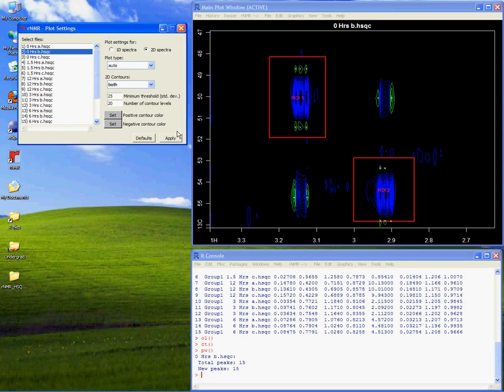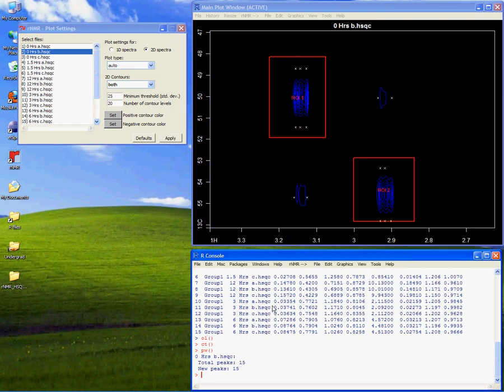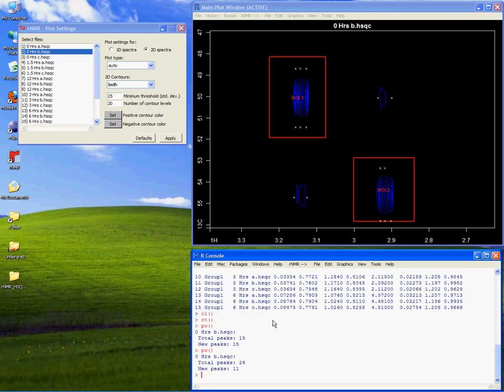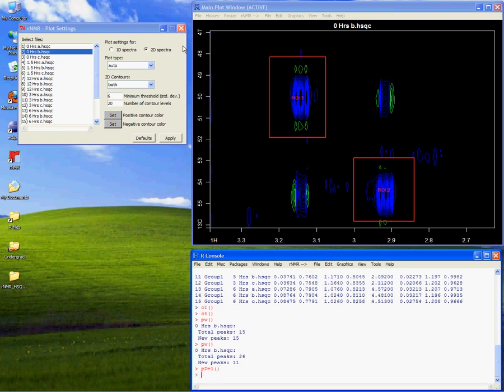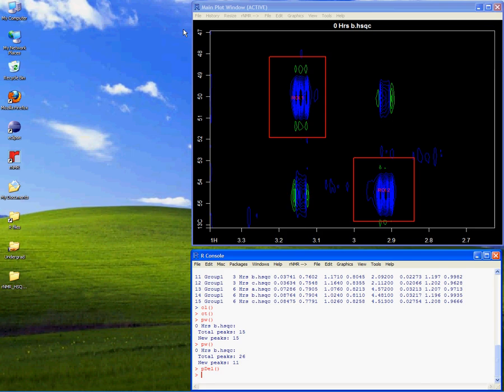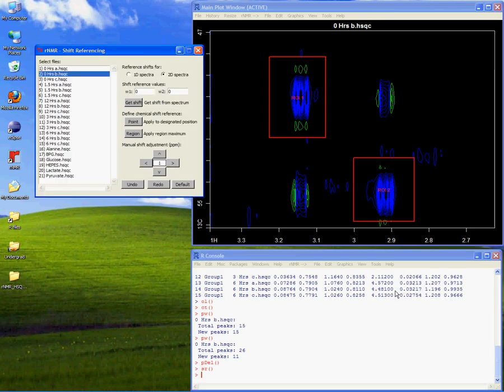Similarly, the contour threshold for two-dimensional spectra also acts as a peak-picking threshold. Because metabolomic studies usually involve the analysis of multiple spectra, another of our goals in designing RNMR was to simplify batch operations. I'll demonstrate this using the shift referencing feature.